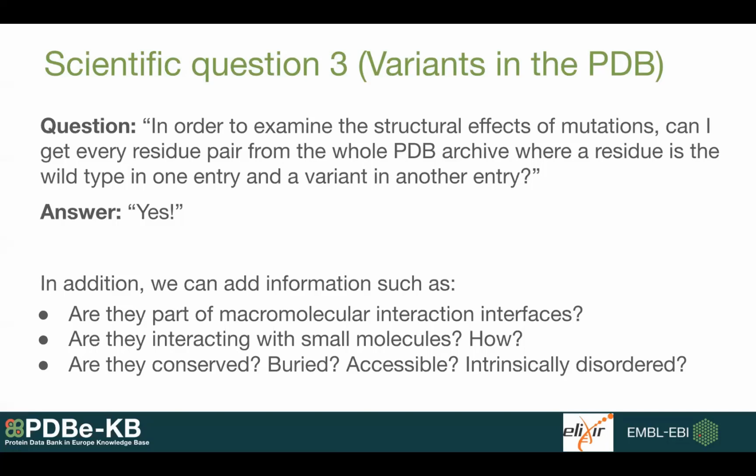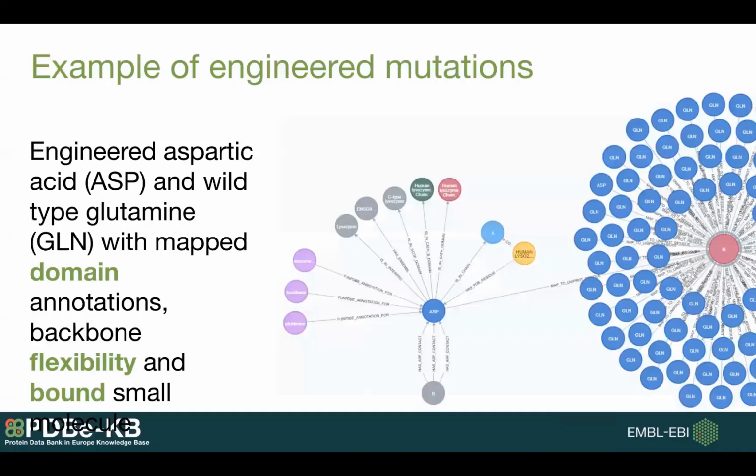And you can enhance this data set with information on are these residues involved in interaction interfaces? Are they interacting with small molecules? And in fact, if you are interested, you can dig down to the atomic level details of small molecule interactions. Are these residues conserved? Are they buried, accessible? How accessible they are in terms of angstrom squared? And are these flexible? And so on. Actually, there is much more in there.